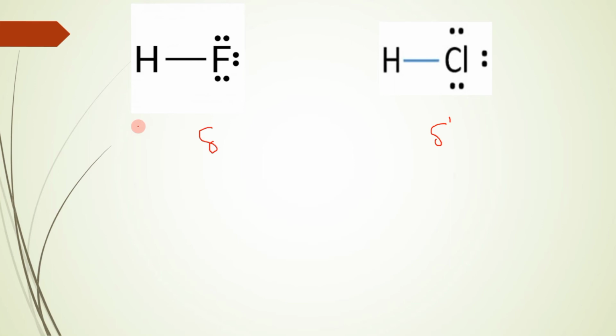Sigma is shielding, so here we are protecting a particular nucleus from the applied magnetic field.